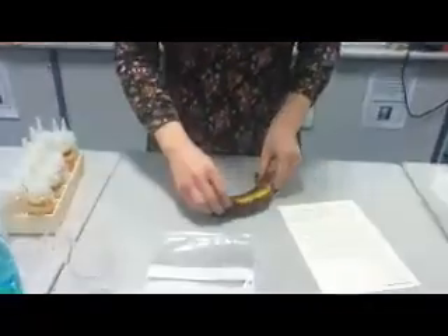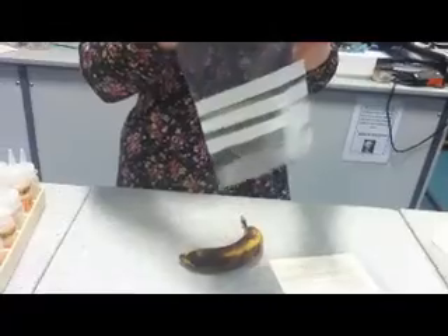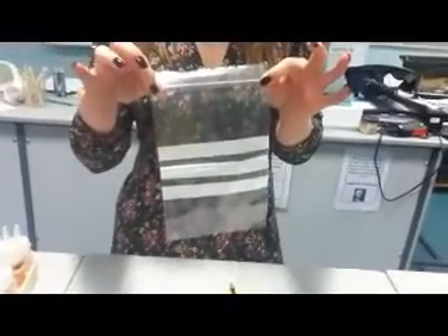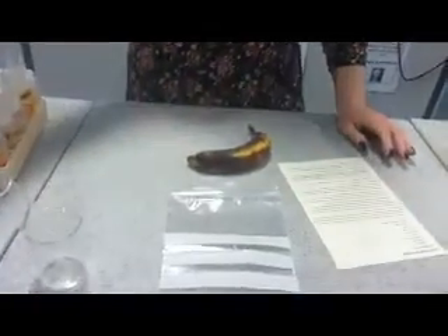You're going to need a banana. You will need a zip lock bag — one of those that you can move along with your hands and it closes. You don't want to get air in there, so try and keep it as flat as possible. You'll need some extraction buffer.